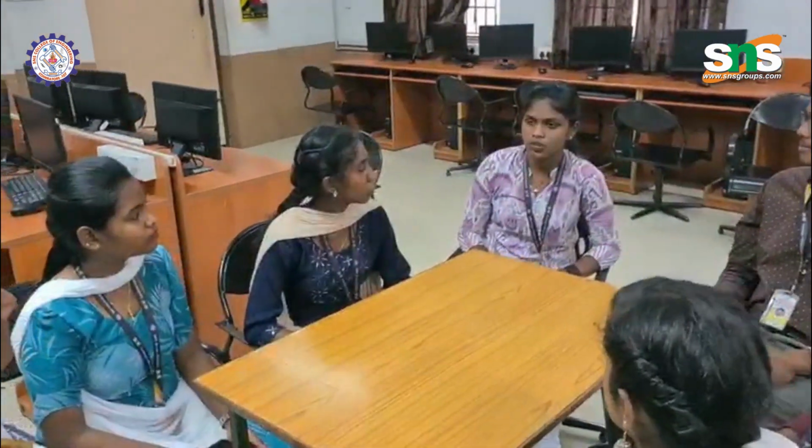Awesome. So let us conclude this session. From this problem we have understood that conductometric titration is found very useful compared to volumetric titration. Also, as he said, in precipitation reactions colors are not recognized that clearly, but in conductometric titration the endpoint is seen visibly, and it is more useful than the volumetric ones.